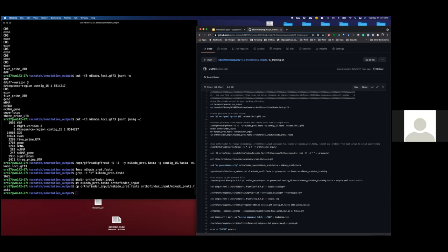Yes. Oh, fab. Yeah, it searches for the orthologous genes from, I assume, the reference, if we're using a reference, probably from a different species, if this is constructing the new one. So it will find whatever ones match, that will be related. Yep. Yeah, that's how it's normally used.